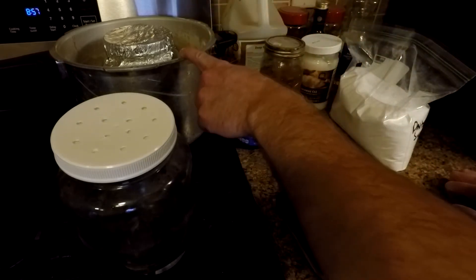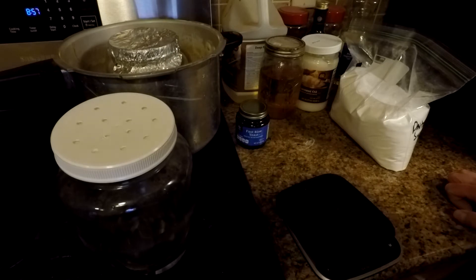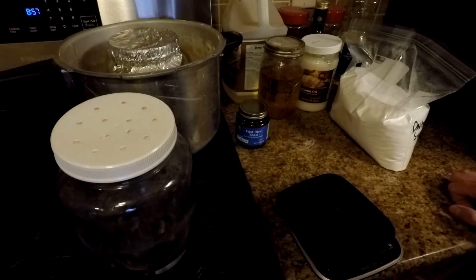I'm going to put the lid on this jar. Always make sure you have water in your pressure cooker. Then I'm going to pressure cook it for a total of 50 minutes.